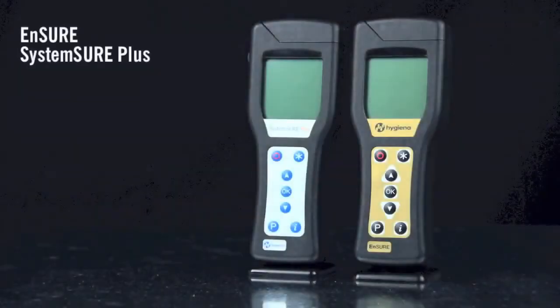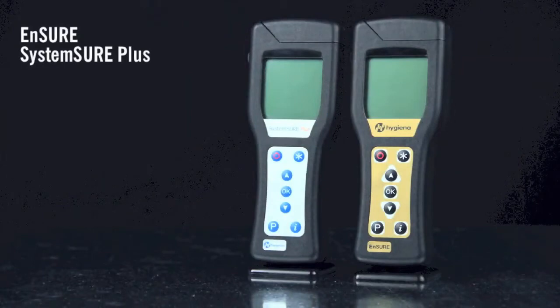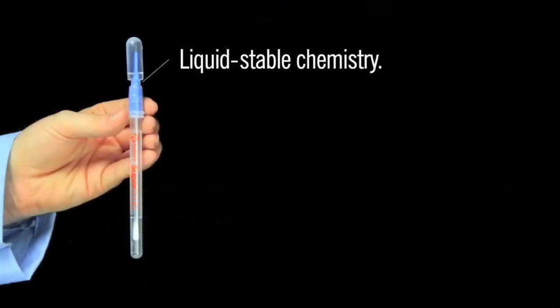SuperSnap is compatible with SystemSure Plus and Ensure luminometers. A liquid-stable chemistry eliminates the need for lyophilized pellets, enabling consistent and accurate results.